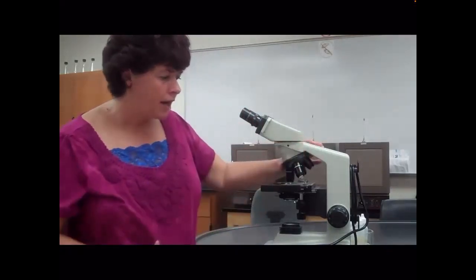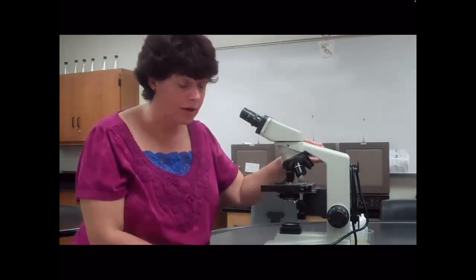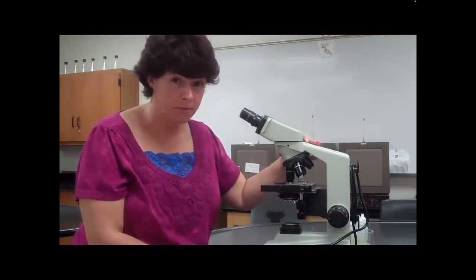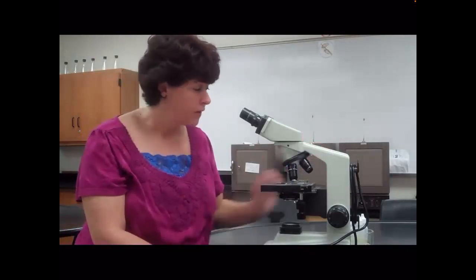To use the oil immersion, I don't want to get any oil on this lens. The only lens that can ever have oil on it is the 100. Let me repeat that. The only lens that can ever have oil on it is the 100. Getting oil on the 40 or the 10 is very, very bad. It will permanently damage the microscope. So I do not want to put the oil on yet, but I do not want to go to the 100. So what I'm going to do is see how I'm turning it to where I have the specimen between the 40 and the 100.